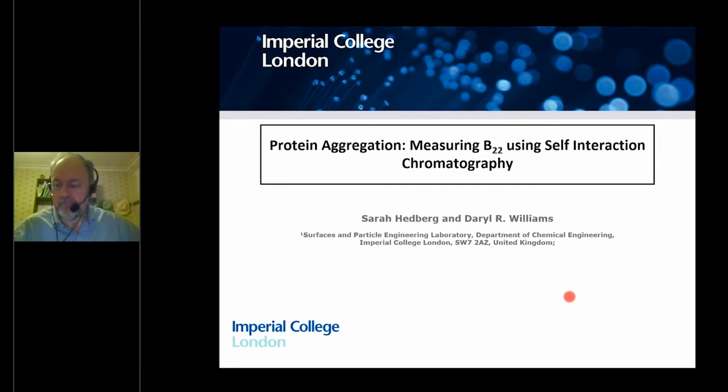The freeze-dried samples were crushed before measuring the surface area. Is the surface area affected by crushing? In short, no. They're very soft materials, so they were just very gently broken so we could get them into the columns. Not enough to actually affect the surface area. Just to make a further point on that, if I tried really, really hard and put them in a mortar and pestle and ground them up, yes, I could change the area. So we have to be slightly careful about that.